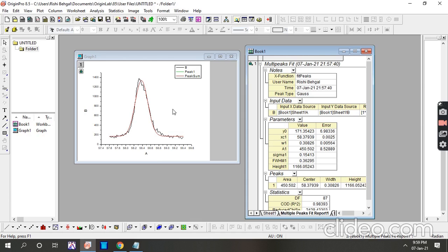This is peak type Gaussian. Here we can change our peak type to Lorentzian or Gaussian. When you calculate using other curve types, you can see a minor change can be observed in the full width half maxima of any peak.